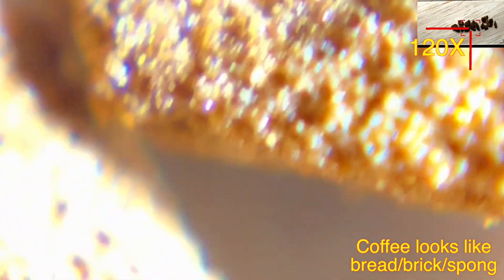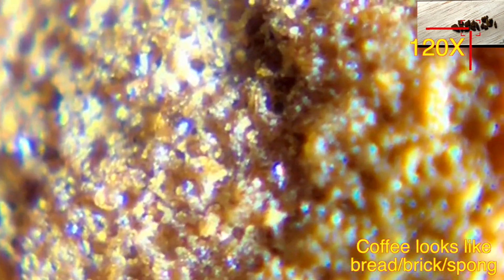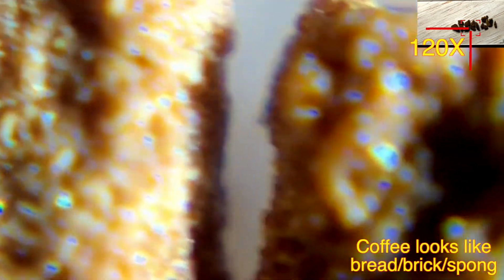Checking coffee under the microscope — it looks like a sponge, or a brick, or a bread sort of thing, having a lot of space and a lot of cavity inside it.